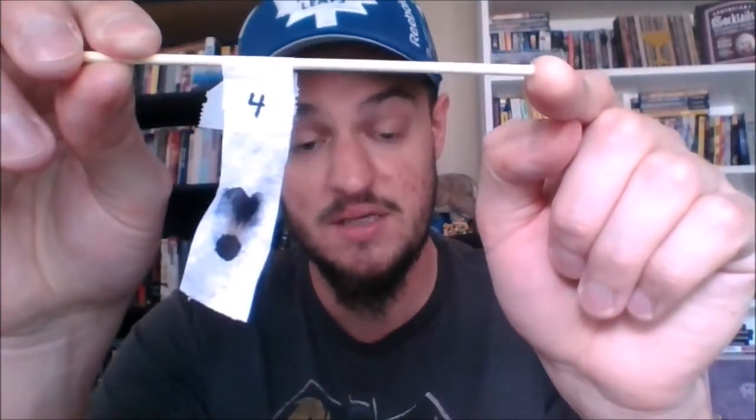Kind of interesting. No matter what, we can see that all four pens had a very different reaction to this experiment. So, depending on which one was used to write a note, I could perform this experiment on that ink and be able to determine which pen wrote a note.